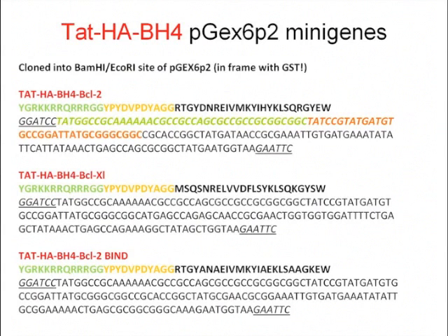I would say if you want to have single point mutations, you could just use this vector and make the mutations via the quick change methods, and that's very convenient. Only when you start to mutate, in this case, we mutated 7 amino acids, and the reason for this was because we identified 7 amino acids, in a biochemical approach and a modeling approach, where the surface is accessible, so we mutated all of them. But typically, you could simply mutate one of those, and then it's convenient to do the quick change.